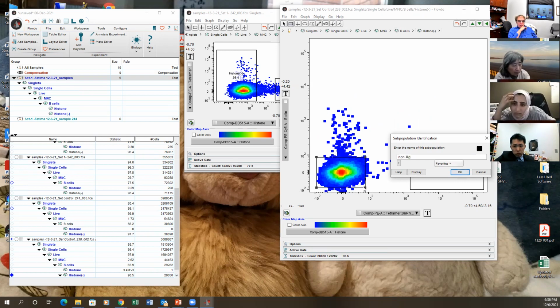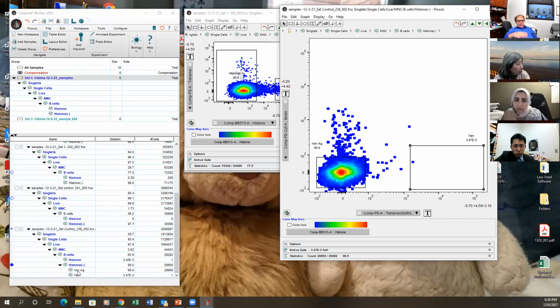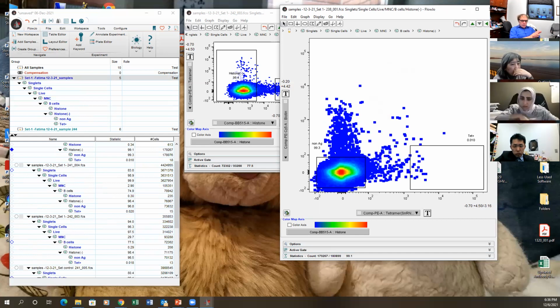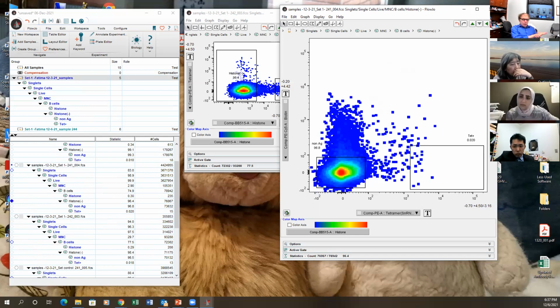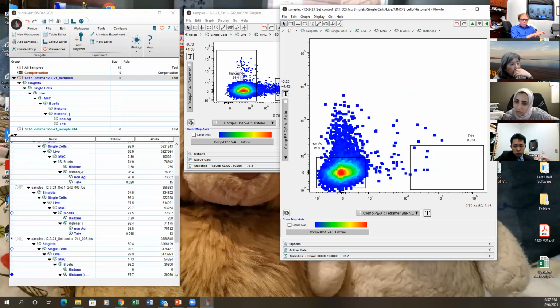Right, and now you've got the no antigen, right? Because they don't bind non-specifically or specifically to anything. So when you do the analysis, you can use that for comparison, and the antigen-specific one should be enriched. Like for COVID-19, most people are enriched for memory B cells. And if they've been immunized, COVID-19 is a nice thing we're doing because it's easier than this, and it informs us how to maybe understand this.